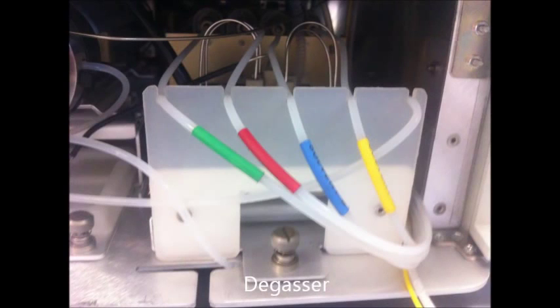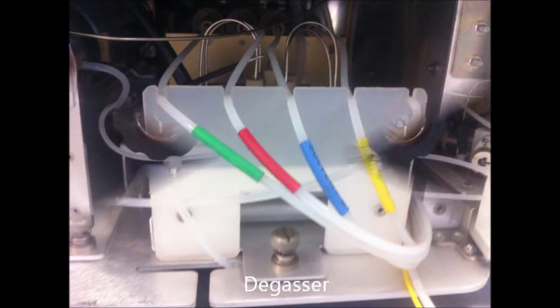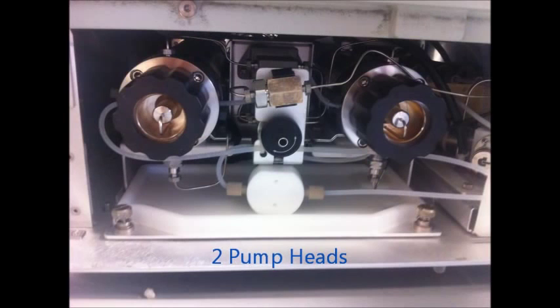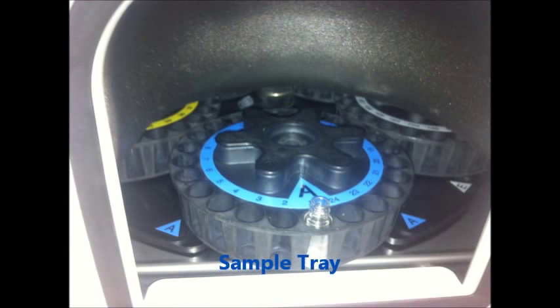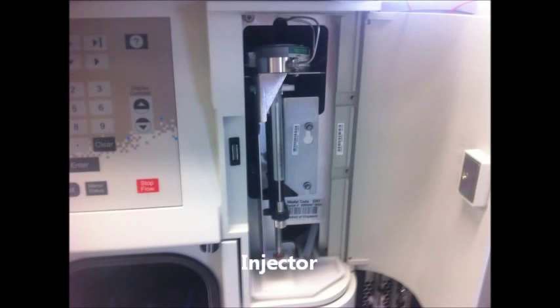If gas was to be present in the eluent, this would be detected as noise and would cause an unstable baseline. The pump is used to generate and monitor a specified flow rate of mobile phase, typically milliliters per minute. The sample tray holds the vials and rotates to allow the injection syringe to collect the samples. The injector is able to introduce a specific amount of the sample into a continuously flowing mobile phase stream that carries the sample into the HPLC column.